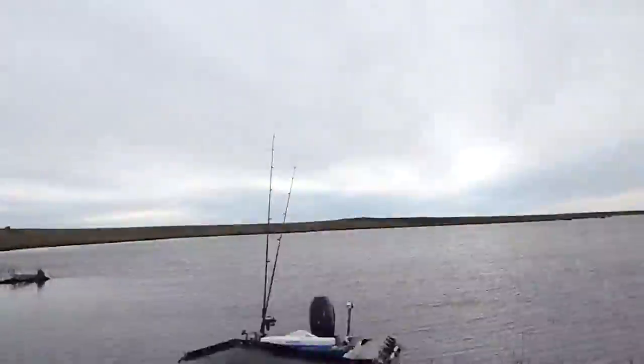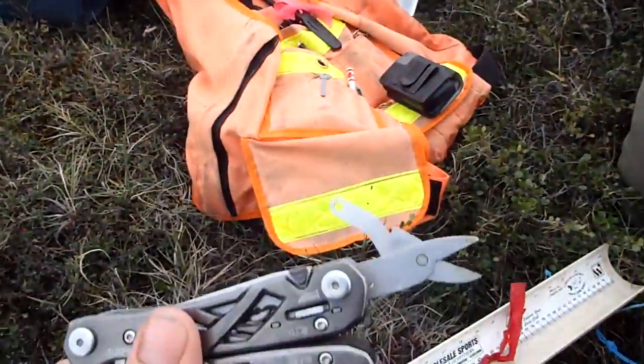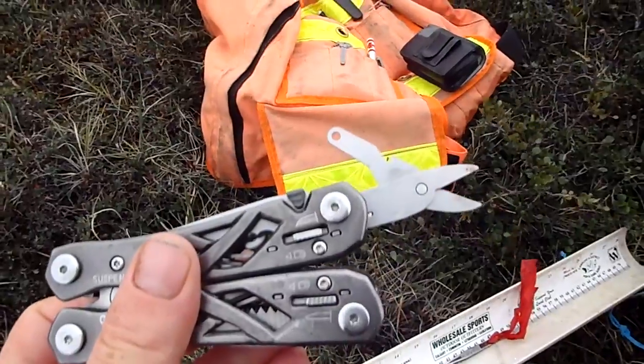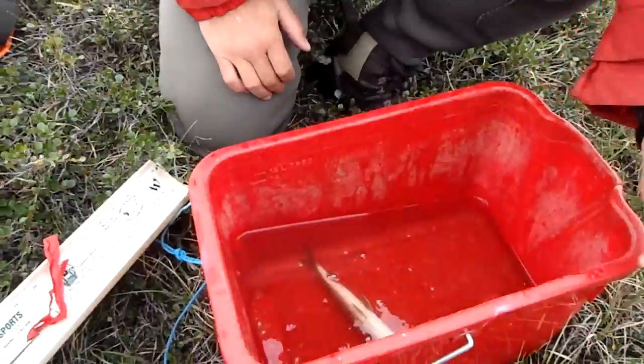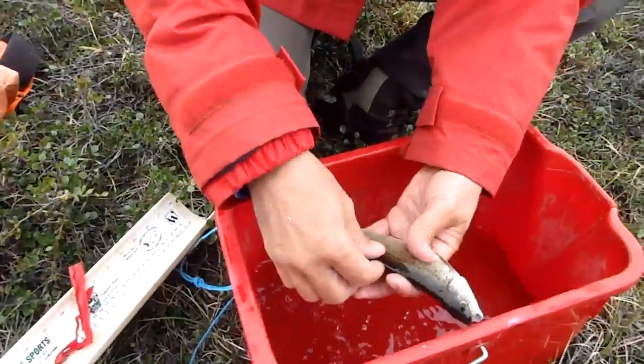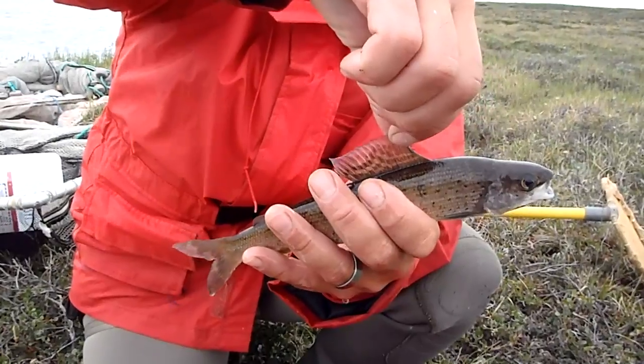This is Otolith Extraction from Arctic Grayling, take two. We've got some kit here. What we have is our tool, which is my other bin with a pair of scissors on it, because we don't have a proper pair of scissors with us. We have our fish, which is one beautiful Arctic Grayling, caught today in a gillnet — did not survive the ordeal.